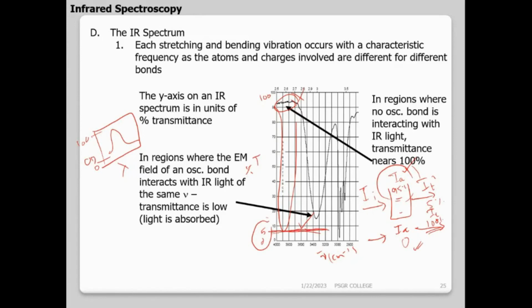So if I stay low, I have more absorptions. The molecule is absorbing. If I have high peaks at higher values, that is waste because the molecule is not absorbing. All the incident radiation goes out unused. Generally, from 0 to 30 we say strong absorption. It is low transmittance, but strong absorption, so it is said to be a strong peak. Then 30 to 70 is known as a medium peak, and 70 to 100 is known as a weak peak.